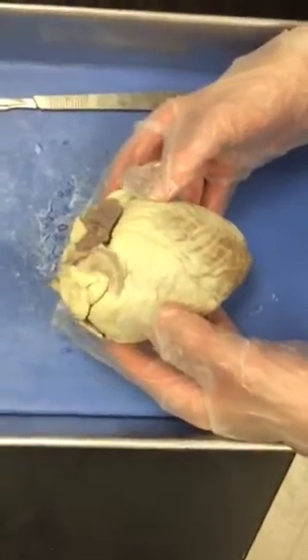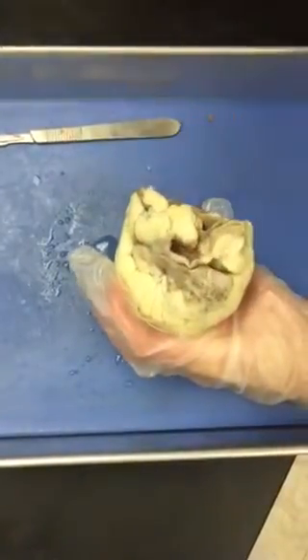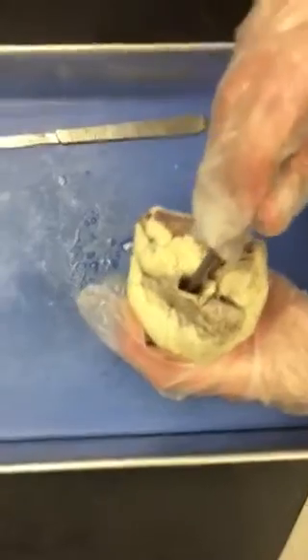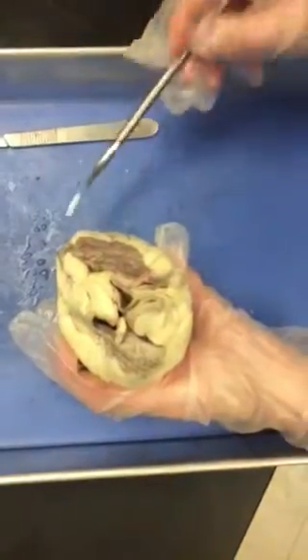17, extending out of the right atrium is the superior vena cava vein. Place a probe into it and see that it leads directly into the right atrium. This is a good strategy to be sure that it is the correct structure. 18, in the space below, explain the function of the superior vena cava.